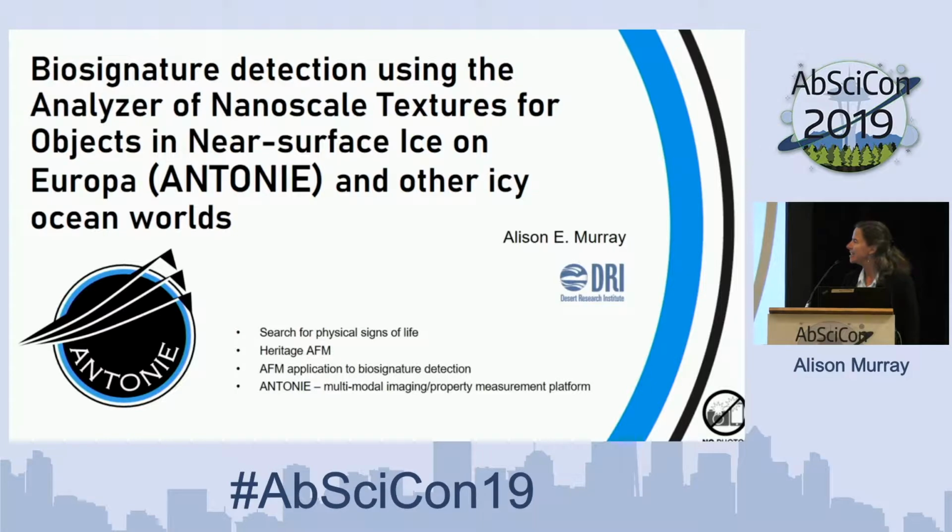ANTONIE today. ANTONIE is based primarily on a microscope, an atomic force microscope. It was named in honor of the father of microbiology, Antony van Leeuwenhoek. The clever naming for that is due to Brent Christner's midnight acronym searching algorithm. I'm going to just get started here.